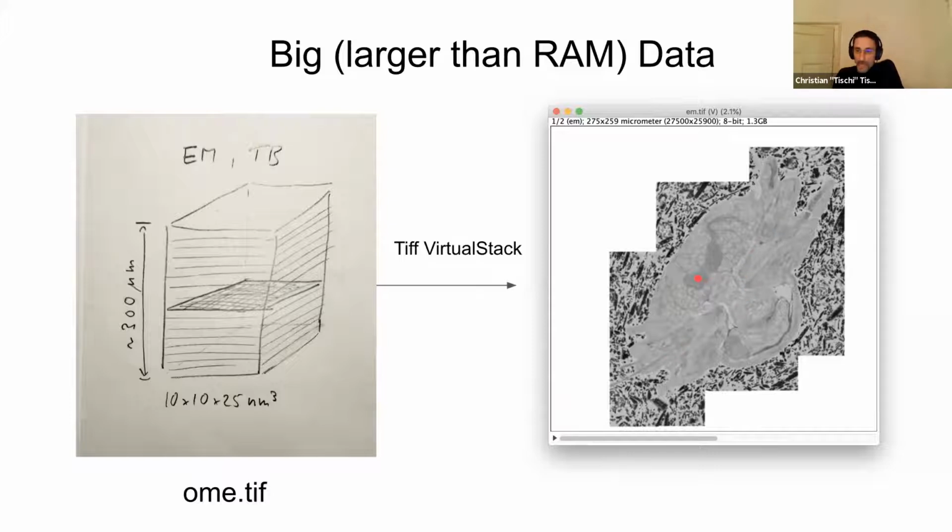This is, by the way, the Platynereis, some muscles. This is its brain, kind of. These are all the brain cells, so it's really a beautiful data set.